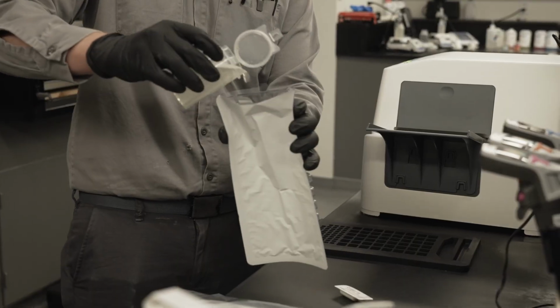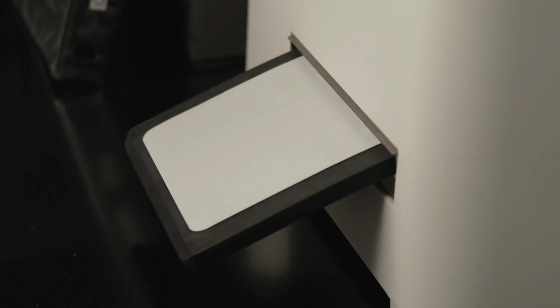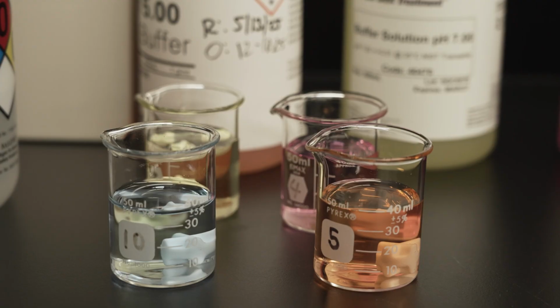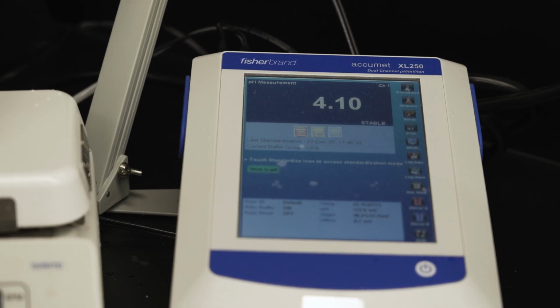So how often are we doing these analyses? Some we do every day, like testing for bacteria levels and levels of solids in different stages of the treatment process. Everything is on a big rotating schedule, and many of the things we test for once a month or less, like levels of different pesticides and even radiation levels, are not changing quickly in the plant, so they don't have to be tested every day.